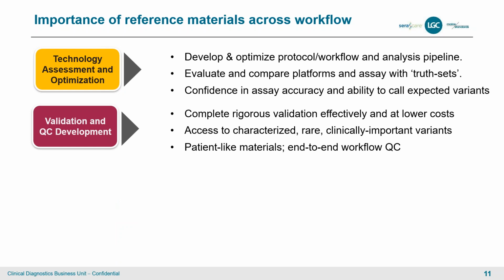Right? And then when you get into validation QC, you now have a protocol sort of figured out and validated, right? You're now thinking about both clinical validation as well as analytical validation. So the goal in this step really is to make sure that you thoroughly confirm what your protocol is actually doing. What is the specification and is it actually meeting it?